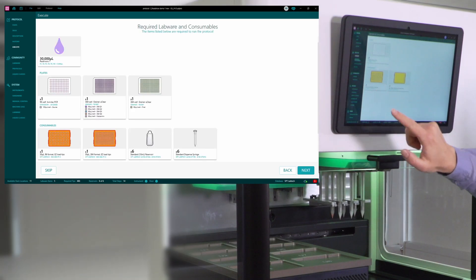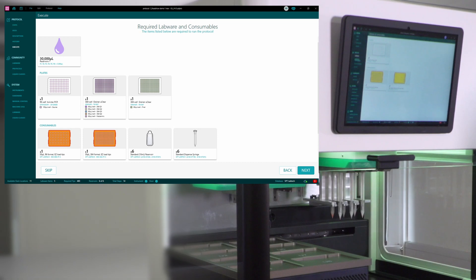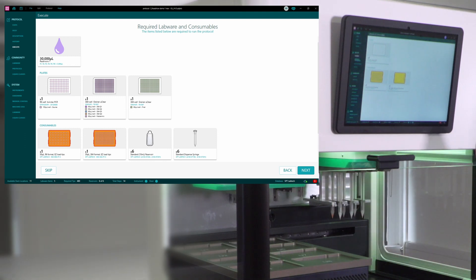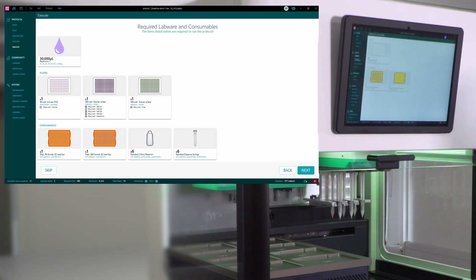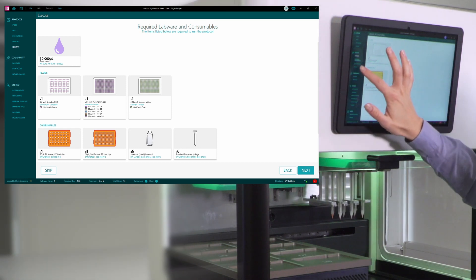And next, in order to prepare for my setup, it is useful to know exactly what parts you require, what labware, what tips and plates. And here on the screen, you can see that I'll need three plates, and I'll need two tip boxes with tips.